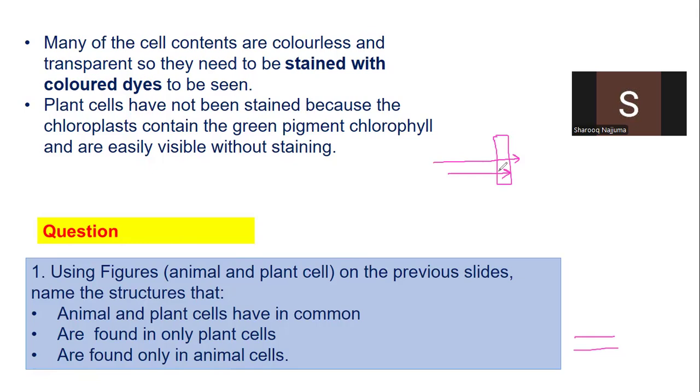I can give you an example of a shadow. You can only form a shadow if you obstruct light. If you stand in the sun and you obstruct light, then your shadow will be formed. So take the shadow to be an image. When it comes to the light microscope, for different structures to be seen, those structures should be able to interfere with the light waves, or obstruct light. So it's only those features that can obstruct the light waves that their images are going to be observed.